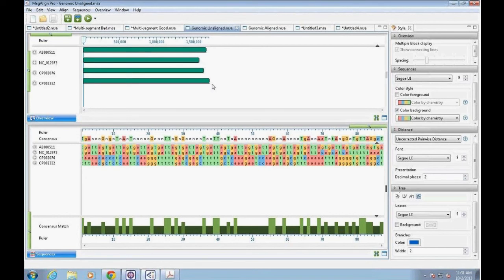So for the previous 2 workflows, we've used the Clustal Omega and MUSCLE alignment methods, and I've also used their default parameters by simply selecting align using MUSCLE, or whatever method we used, from this drop-down toolbar. But for this tutorial, since we're going to use MAUVE, we'll also explore how to alter parameters prior to alignment. Now, for most alignment projects here, the default settings are entirely suitable, including this one. So we could very easily just select align using MAUVE, and we would be fine here.